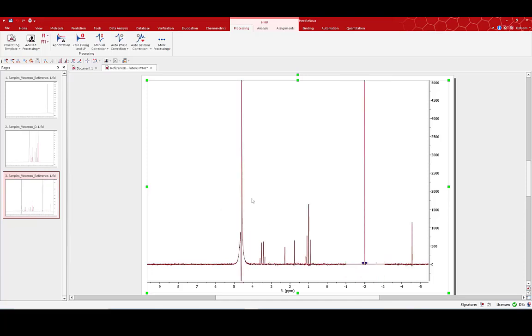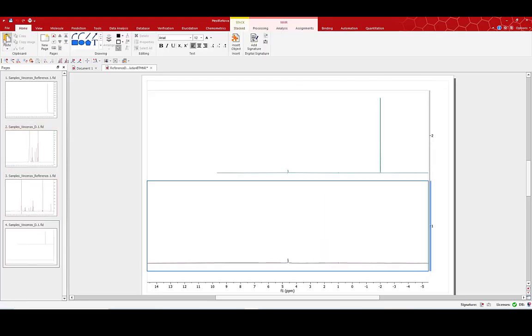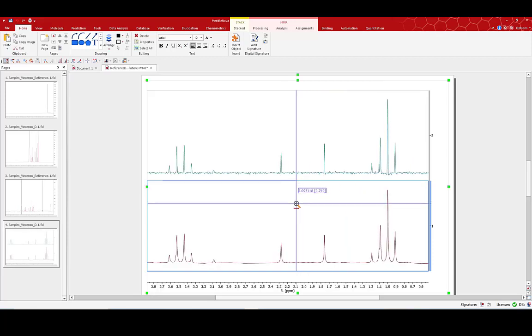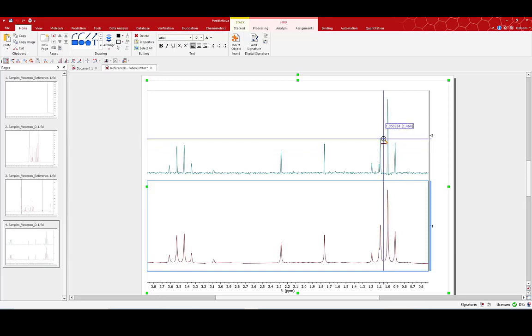Pressing OK, the reference deconvolution runs. I can now compare my processed spectrum with my original spectra by simply stacking the two using the stack option. Here we have both spectra, and zooming in on the peaks of interest we can see the improved line shape — effectively we've standardized the line shape in the processed spectrum, narrowed the peaks, and I'm now separating what was previously a shoulder out as a distinct peak.